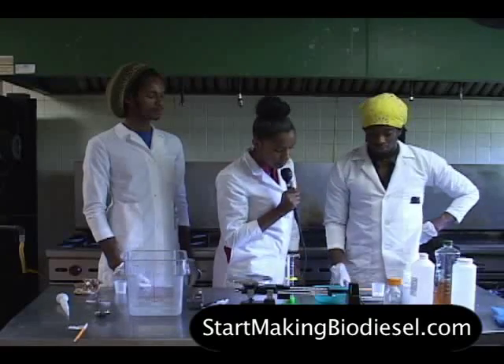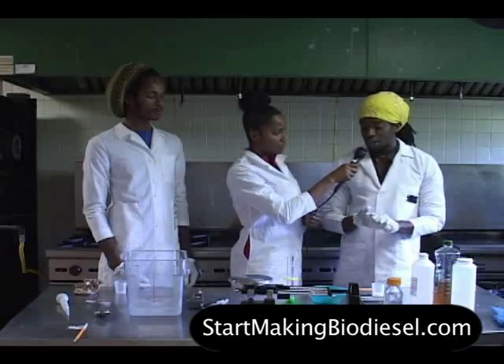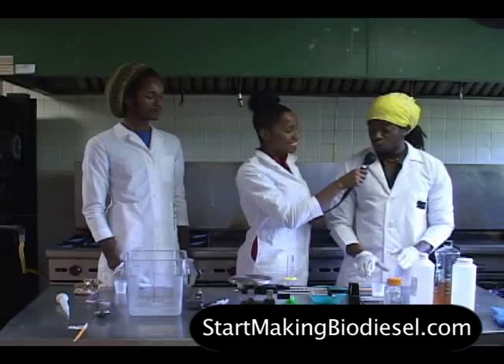This is called sodium hydroxide, or lye. We're putting one gram of it into the cup.